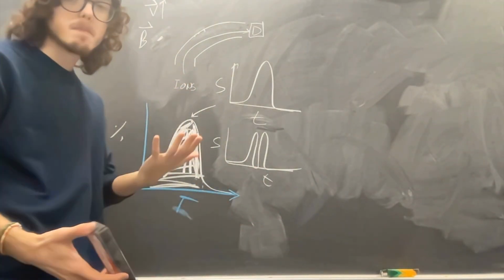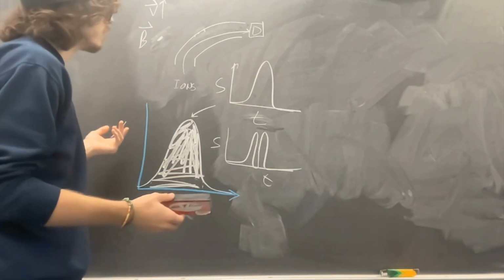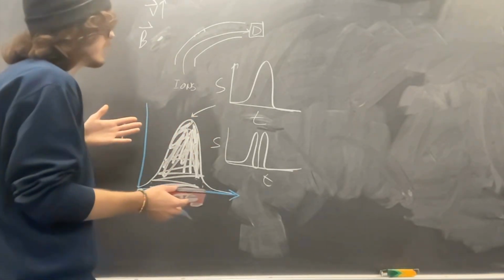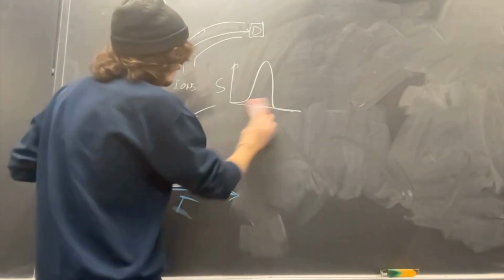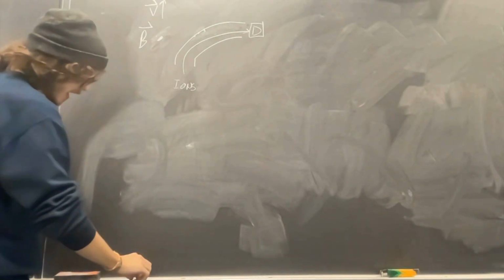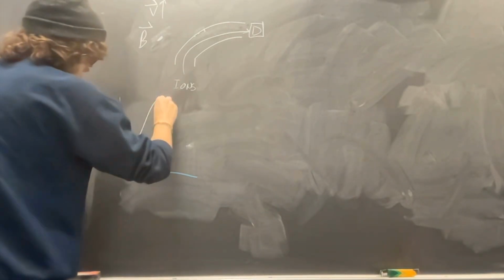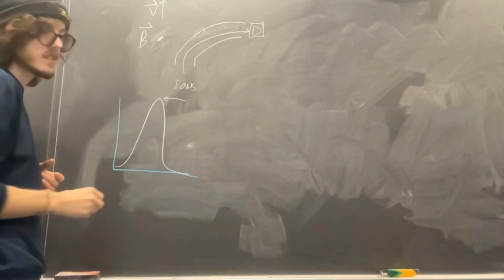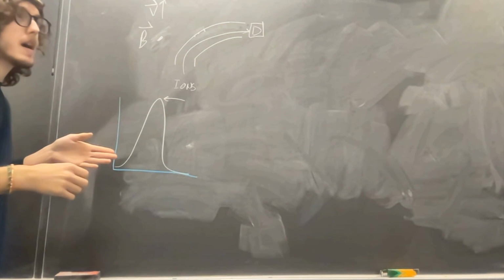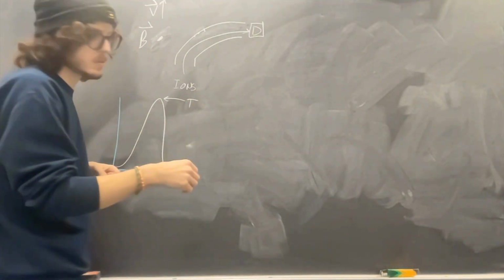So double focusing instruments are typically a lot more preferred in relation to single focusing. So how do we fix that? Well, it's pretty simple. All we have to do is select for this maximum, or bring the amount of molecules that we're talking about just to the temperature, or you can think KE, that we are actually looking at.